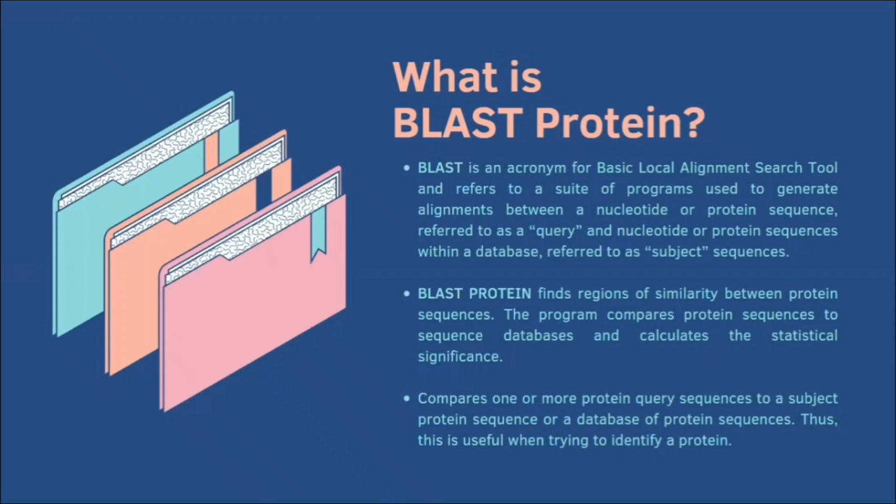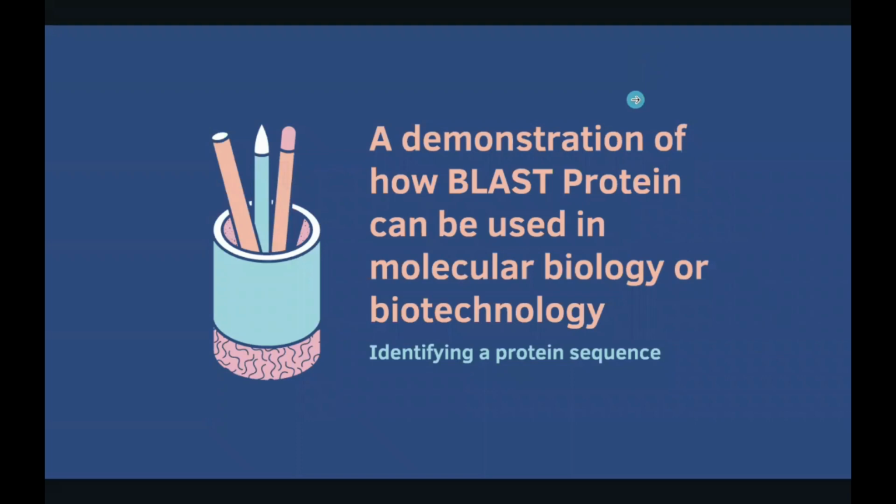Most of the time, BLAST protein functions to infer functional and evolutionary relationships between sequences, as well as to help identify a protein. Now we are going to show a demonstration of how BLAST protein can be used in molecular biology or biotechnology in terms of identifying a protein sequence.